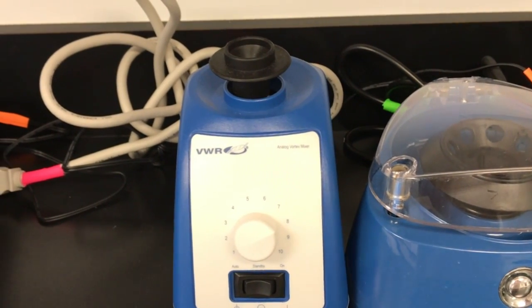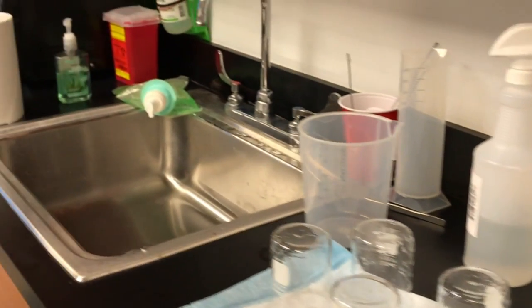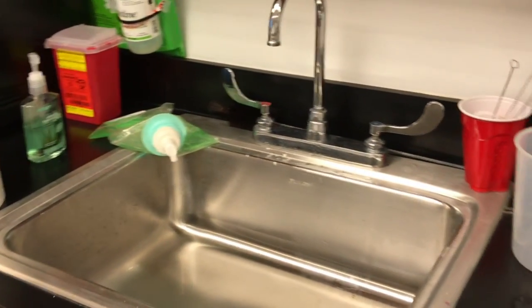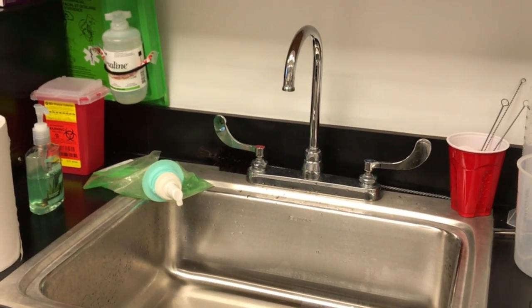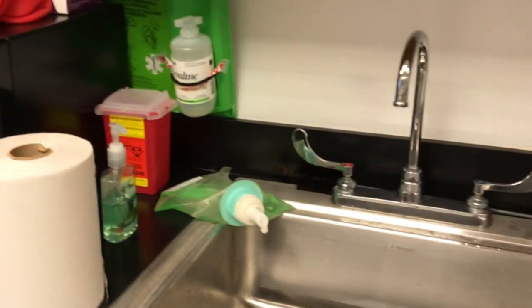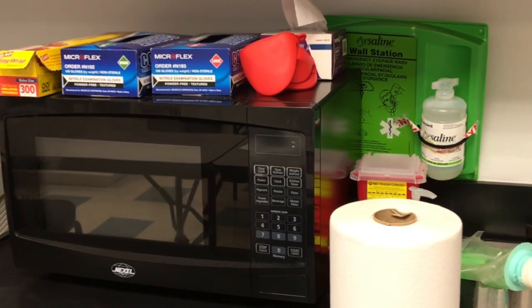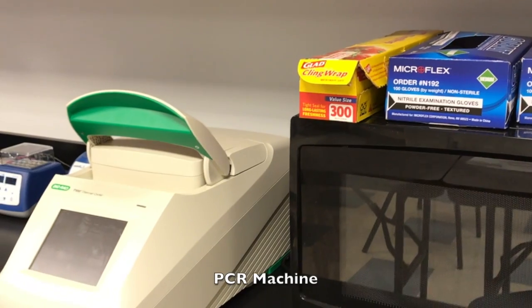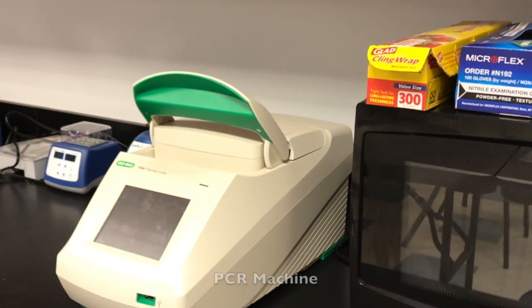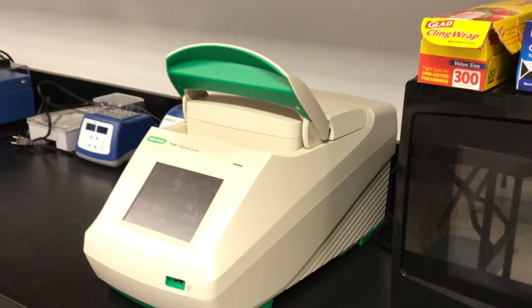Next to the centrifuge is a vortex — that's the opposite: here you want to mix your sample, so it starts vibrating a lot when you turn it on. Here there is a scale, and then next to it is the sink. Unfortunately that's also part of the lab — we do have to clean all of our supplies, and of course right now it's important to wash our hands. Here's a microwave, you're probably familiar with that.